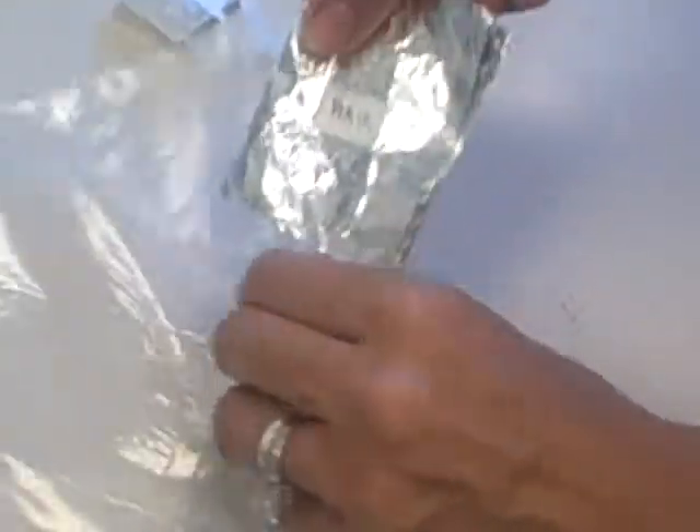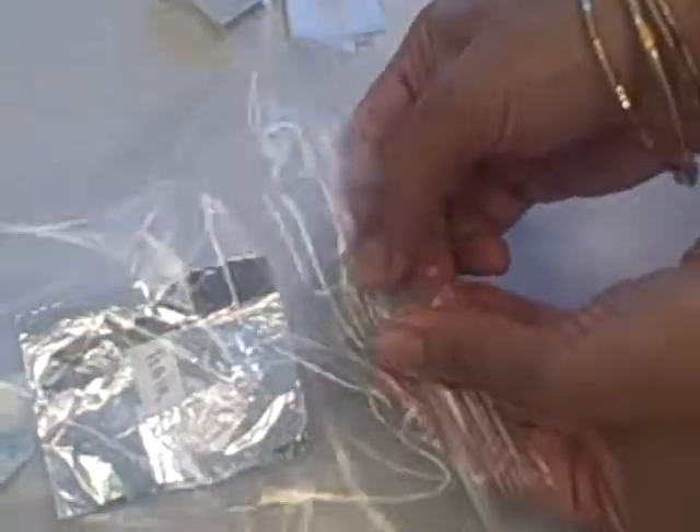Then I will fold over the piece of tin foil to enclose the hair, and then put that piece of tin foil into my plastic bag with a desiccant pellet. And that's it for hair collection.